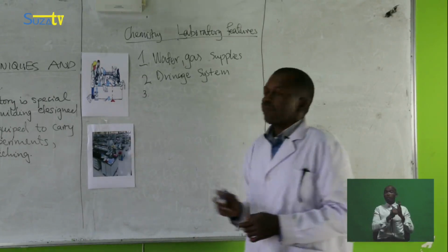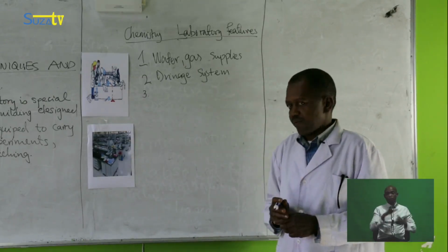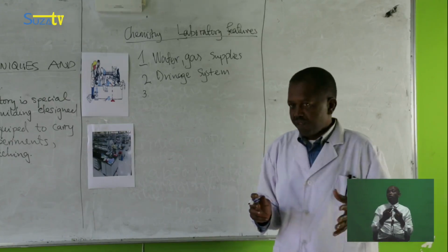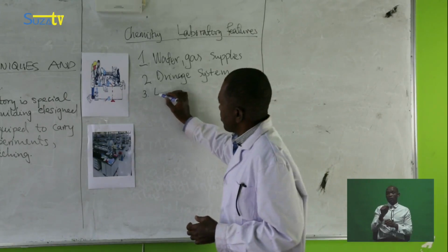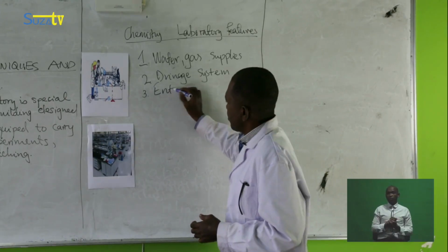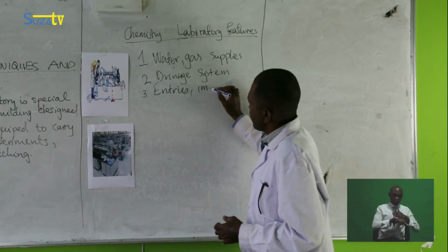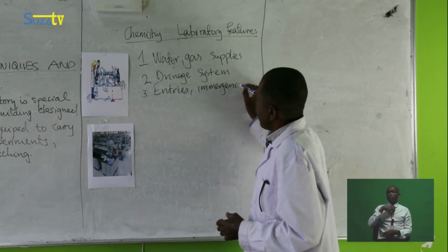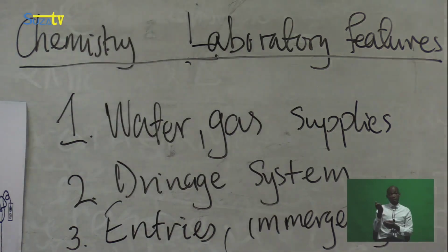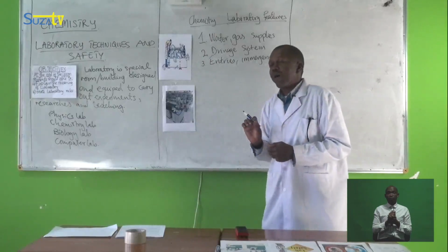Also, a laboratory should have two entries, one of which is an emergency exit. These doors should open outward.